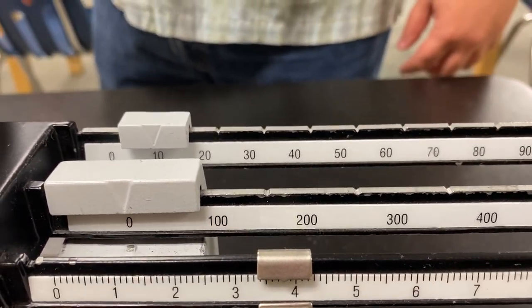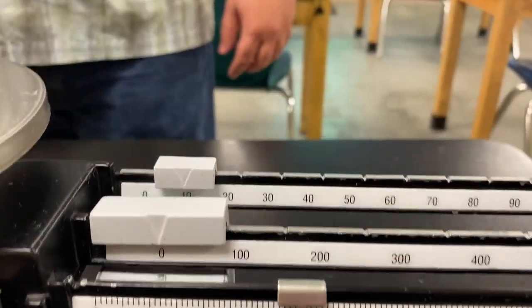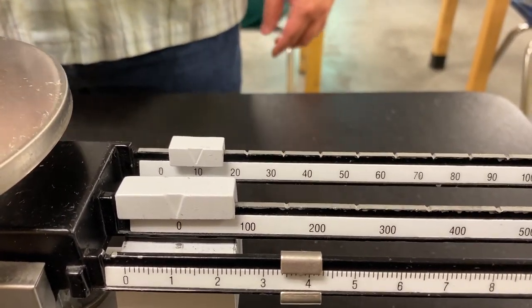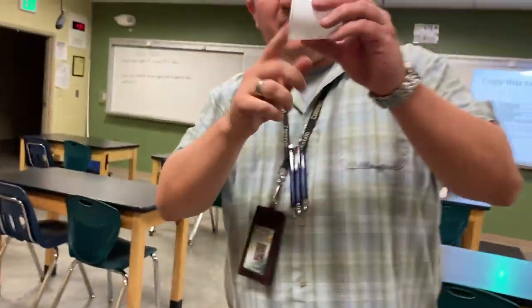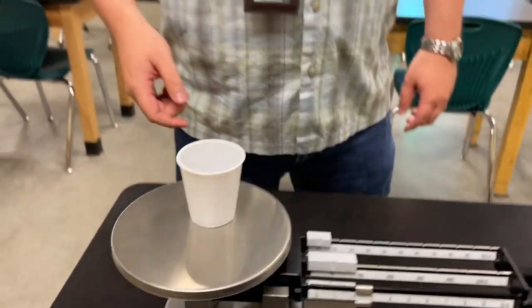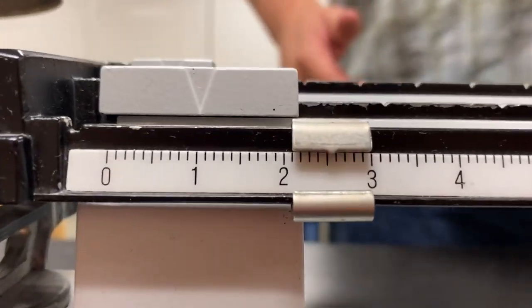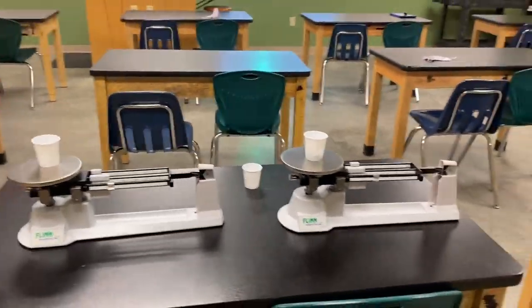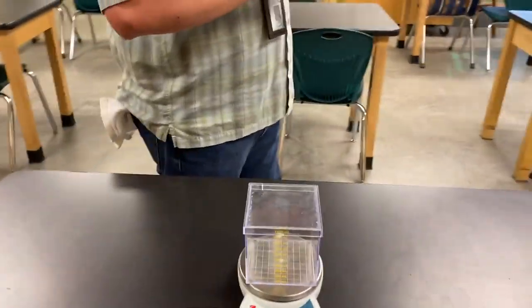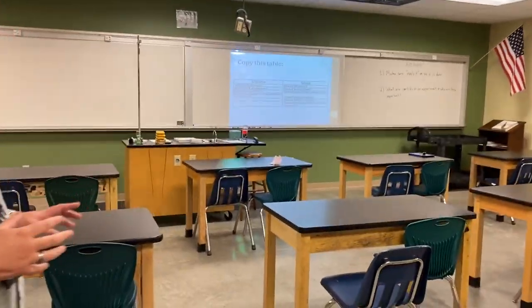Here's our measurement that Ms. Mann is recording for us right now. Make sure you know how to read a triple beam balance — review your lesson if you do not know how, it's in the book. The problem we have is that this situation is the mass of both pearls and the cup. We don't care about the cup, so what we've got to do is also measure the mass of just an empty cup. We've got a nice empty cup right here and we're going to measure the mass of that, so you can get the number through your own work.